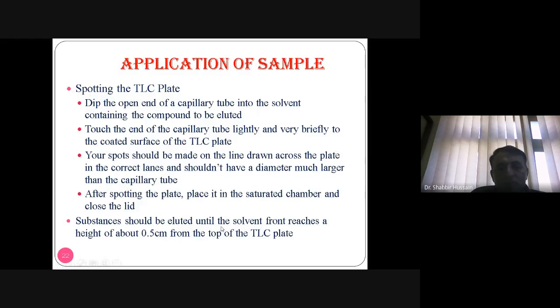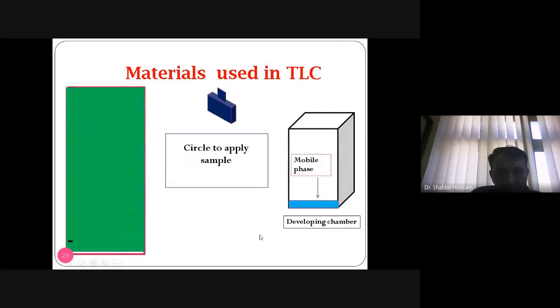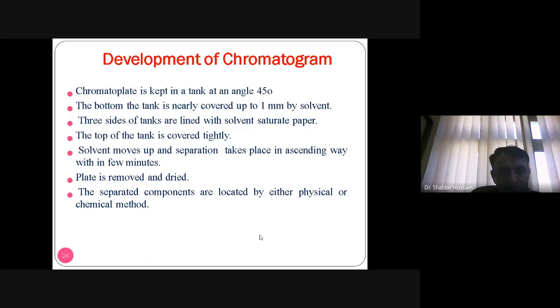Substance should be eluted until the solvent front reaches a height of about 0.5 centimeter from the top of the TLC. Right, like this one, you have to draw the line and you make a spot. It should not be greater than the capillary का जो spot है इससे ज़्यादा नहीं होना चाहिए। डेवलपमेंट ऑफ क्रोमेटोग्राम। अब इसके अंदर आप टीएलसी को कैसे रखोगे?